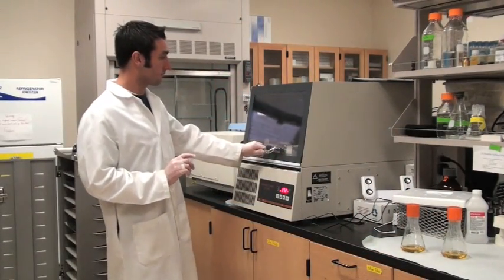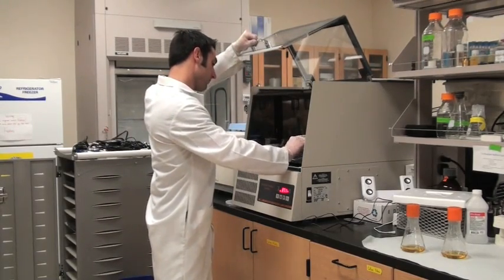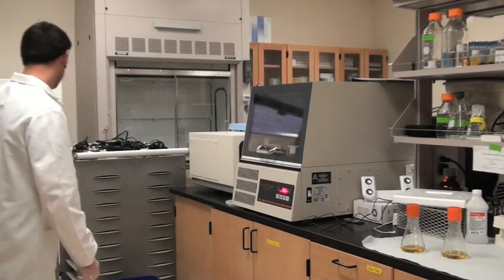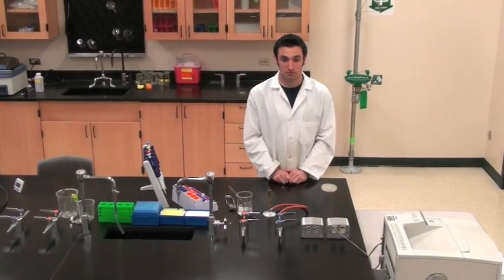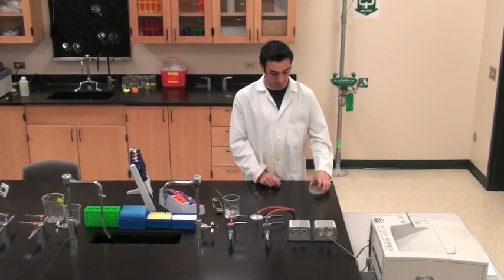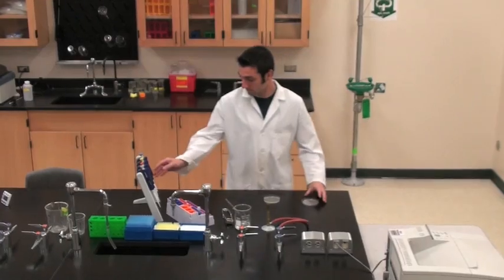Let it incubate for 30 to 45 minutes. Incubation speeds the growth of cell cultures and also allows the cells to recover and express any of the plasmid-borne antibiotic resistance proteins. After incubation, transfer 50 to 100 microliters of transformed bacterial culture onto an LB agar plate. The agar plate contains ampicillin.